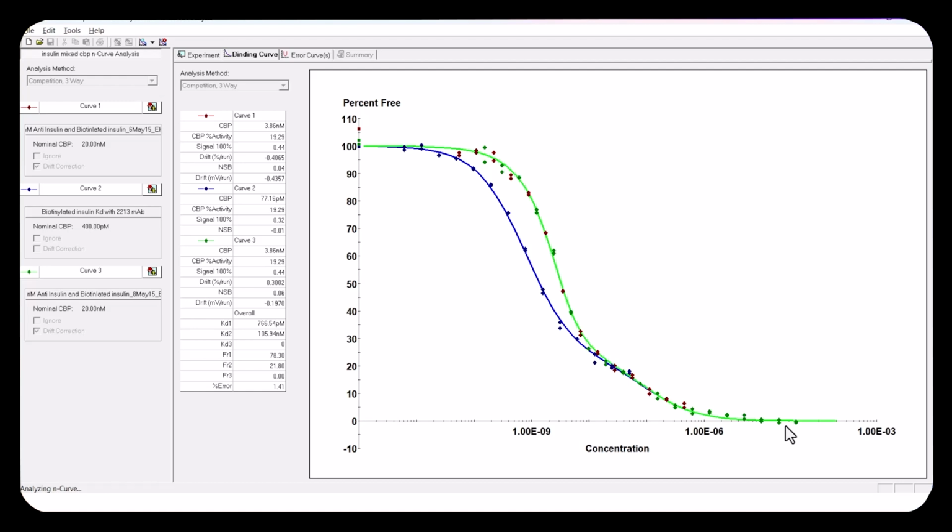The fact that the model fits the data never proves that it's the right model. But when models don't fit the data, usually it's because it's the wrong model choice, although it might be an experimental error like what we saw in the first example here. So, you have to be careful, and choosing the model is a big deal.